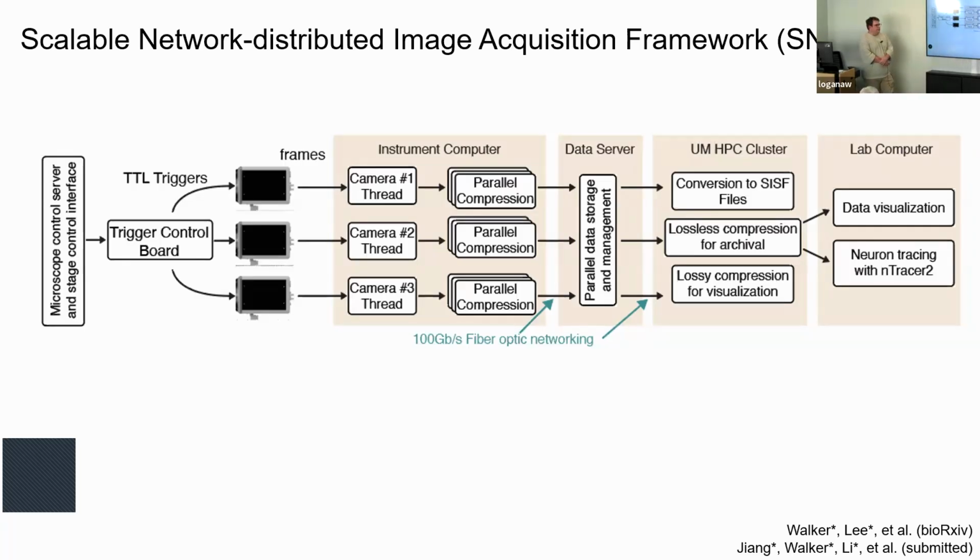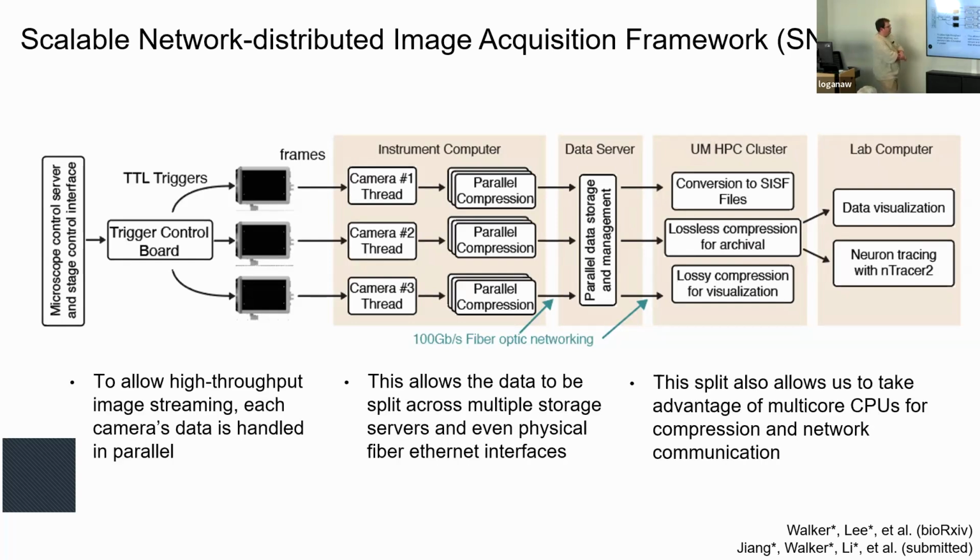So, there's a lot of image deskewing, image flattening, and normalization that has to occur before the data goes from its raw state to something you can actually look at and analyze. And then from there, there's a downstream pipeline, which is the second half of my talk, so I won't go into that too far. This is basically just a summary of what I was just saying.